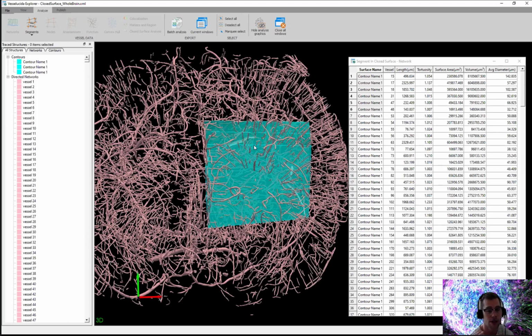So you don't need to worry about doing anything prior, which might limit the amount of data or the resolution that's coming out within those cropped sections. We can keep it at its full resolution and you can work with it just as you would with the whole image stack.